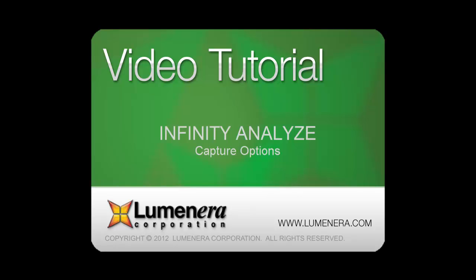This instructional video provides an overview of the image capture options as part of the tutorial series for the Infinity Analyze Microscopy software.